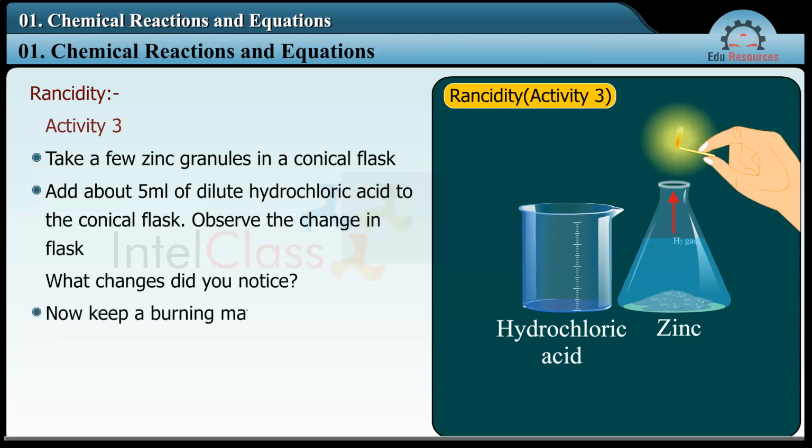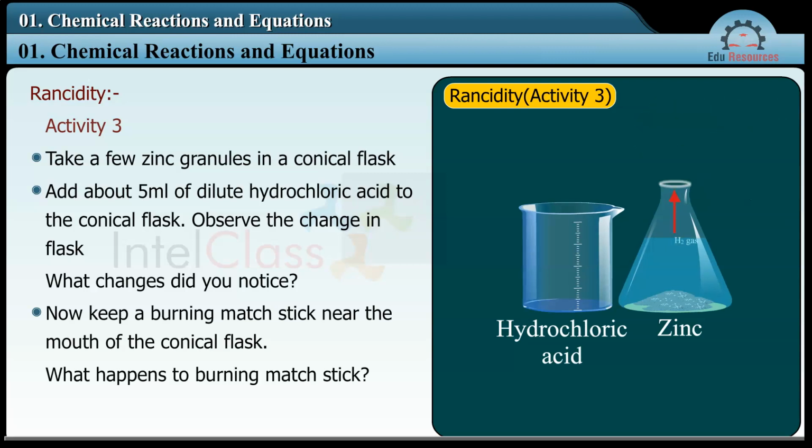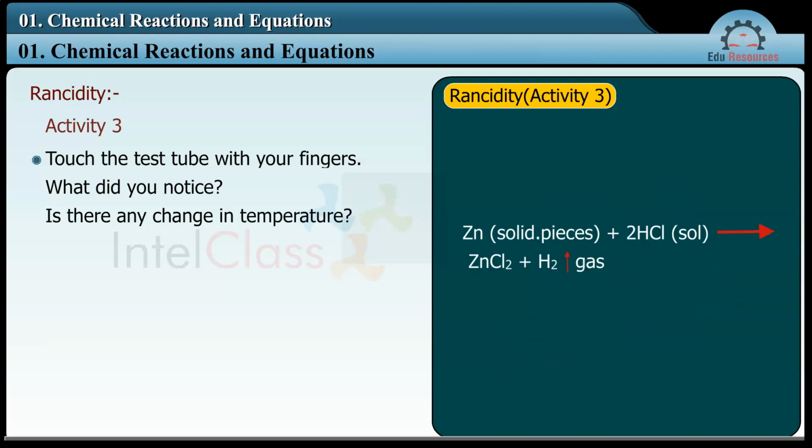Now, keep a burning matchstick near the mouth of the conical flask. What happens to the burning matchstick? Touch the test tube with your fingers. What do you notice? Is there any change in temperature?